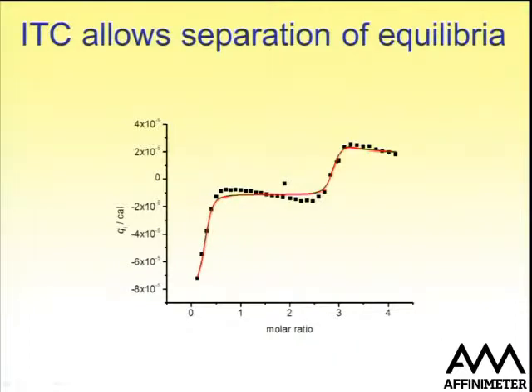So what do we see? First of all, we can fit the data reasonably well, apart from the fact, of course, that this is by definition going to become a plateau in our software because we assume that this is simply a secondary binding site. It looks as if the data has a bit more pattern here than we wanted. Well, we can't demand nature to behave the way that we want it to behave. There is more pattern there, so it means that this binding model, even though it does a reasonable job at approximating the data, is missing something else that is going on, which may need a more complex binding model.